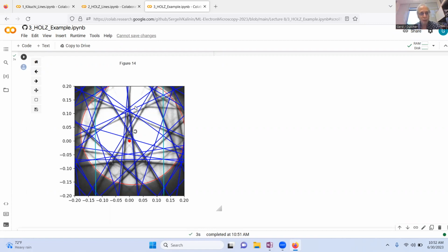And the reason for that is this is a diffraction method that is super accurate with a lot of information. And so you can determine strain, you can determine strain field around the precipitate, you can determine strain field around the dislocation with and without segregation to it, and so on.